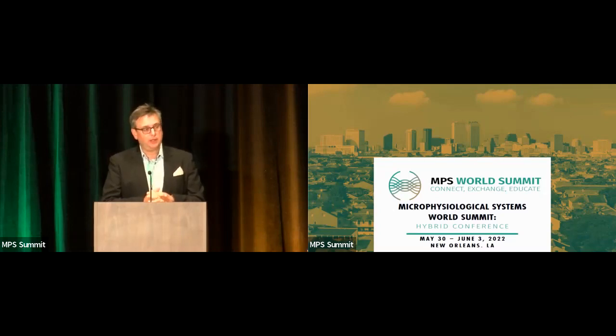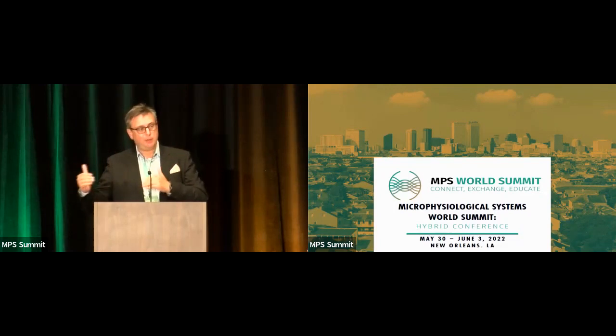That's a great question. So we don't see zonation in these tissues. It's also not really expected due to the size of the tissues. But it's been a recurring topic for us. So I think one of the interests that we have on the microfluidics aspects of microphysiological systems is actually at some point creating a liver system that would allow us to show zonation in that device. And if you have a good idea, Lance, then I'm happy to pick it up.